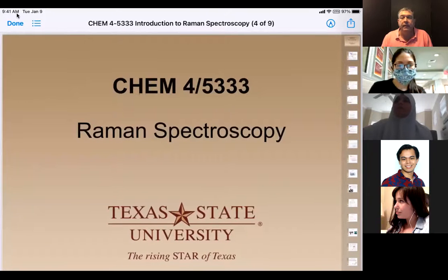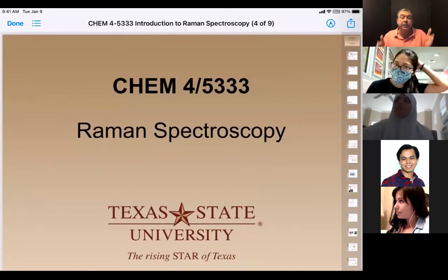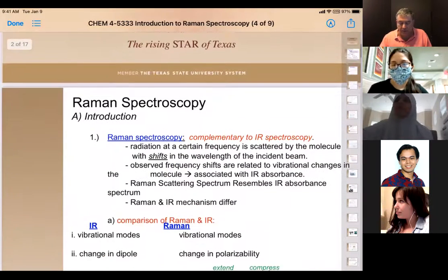So if you've had a chance to be exposed to Raman spectroscopy, you'll see that it actually complements IR because they are basically looking at the same frequency section, and a band in Raman will directly correlate to a band in the IR as far as functional groups and the types of groups we see. Okay, so those bands do correlate. However, Raman spectroscopy takes into account the things that IR doesn't. And so let's go ahead and look at the compare and contrast.